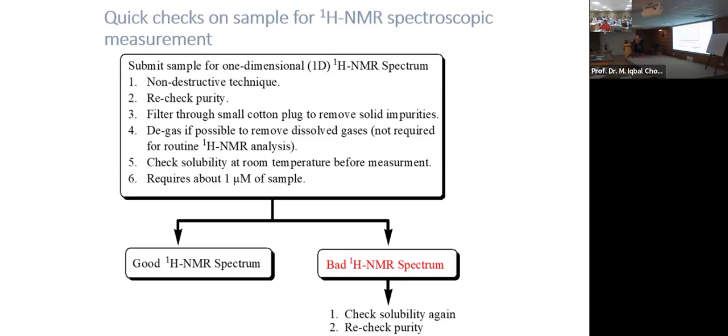It depends on which sample and what you want to do. For example, if someone wants to see the impact of temperature on hydrogen bonding, just as an example for a small molecule, you can have intramolecular hydrogen bonding or intermolecular hydrogen bonding, where two molecules can hydrogen bond with each other, with your 2 or 3 milligrams of sample.